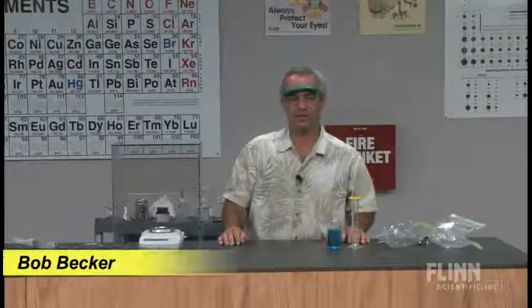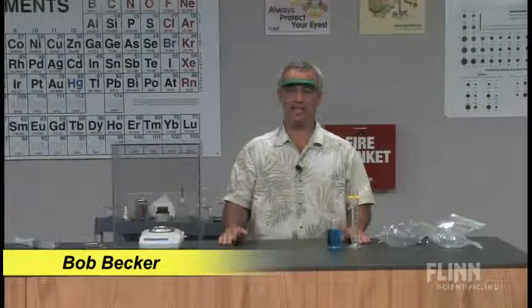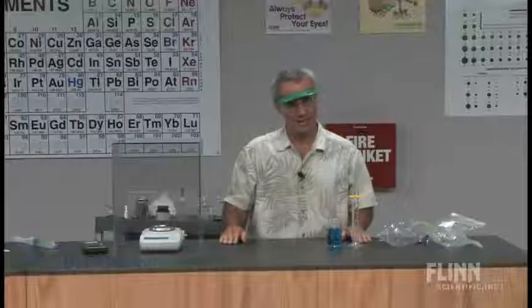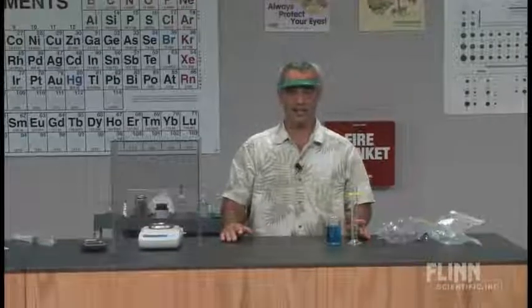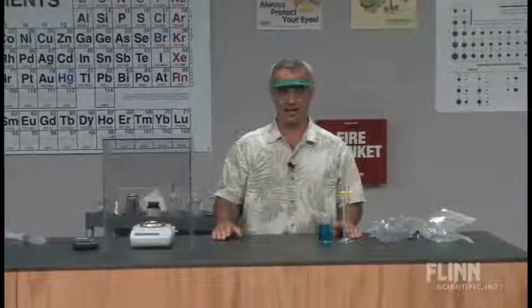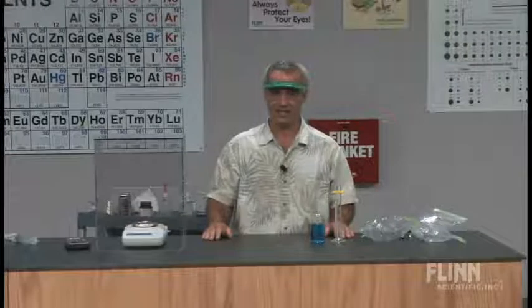I do a lab with my students in the first quarter involving density, not just density of solids and liquids, but also density of gases. The students are required to identify a set of unknown solids, unknown liquids, and unknown gases by determining their density.